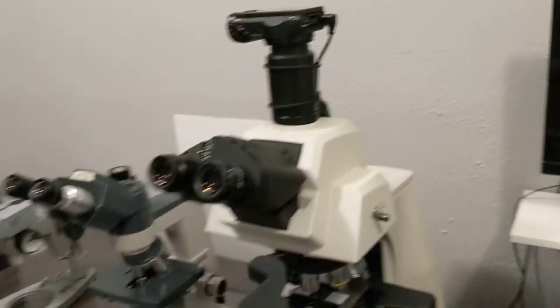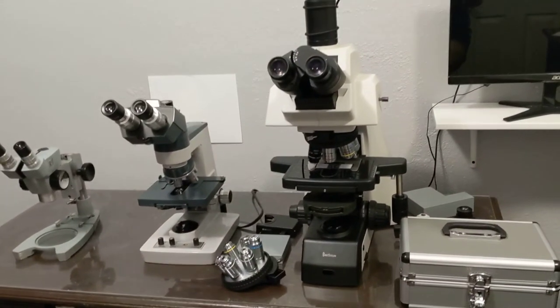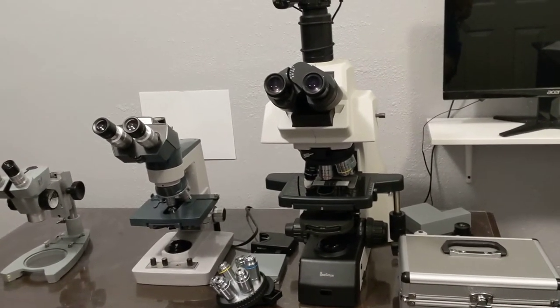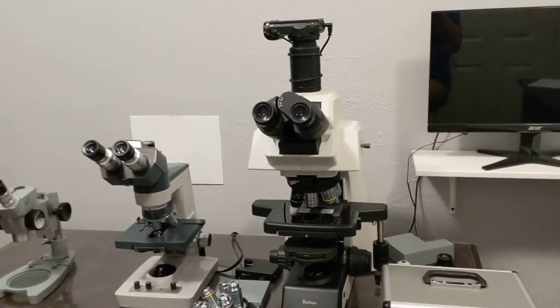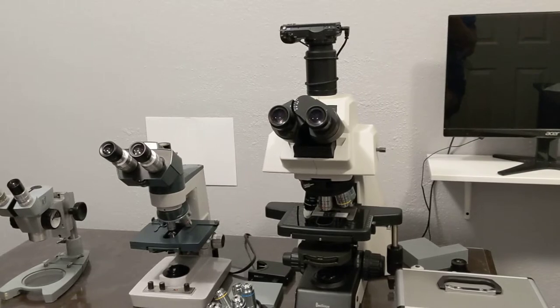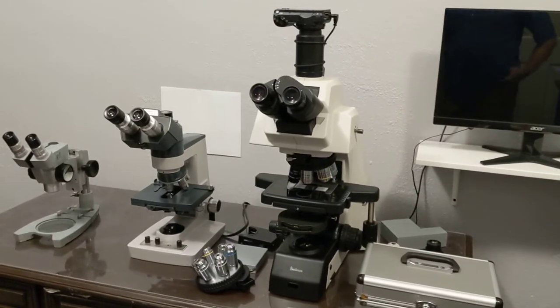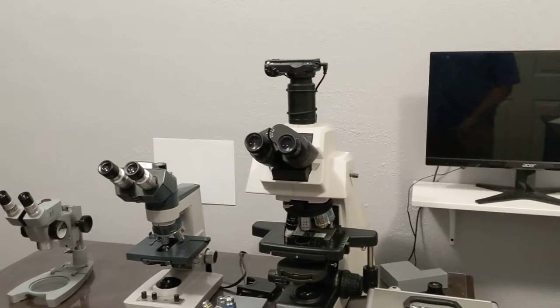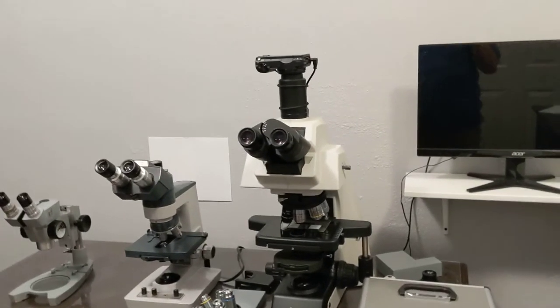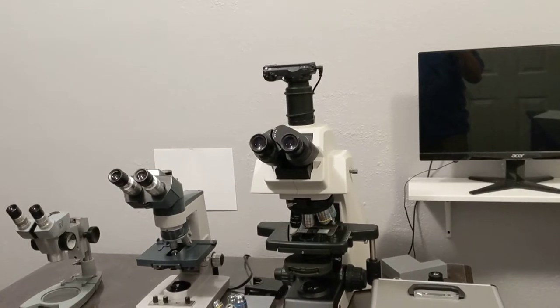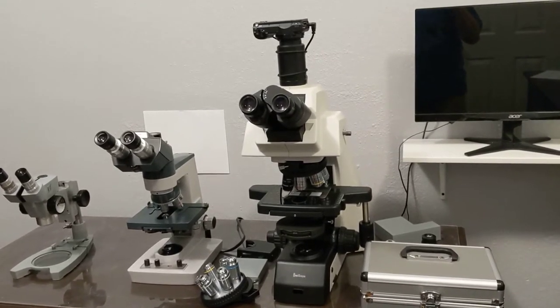Basically the prices of all these components was really low, like sticker shock low. But the lead time is very long, at least two months. And the shipping on this thing was really expensive, like 500 bucks. Moreover, I had to pay 25% tariff on this stuff. So it ended up not ultimately being that cheap. But each individual component, the incremental cost, was pretty low. So I bought the microscope to rule all microscopes. I didn't buy the fluorescence, but everything else I bought.